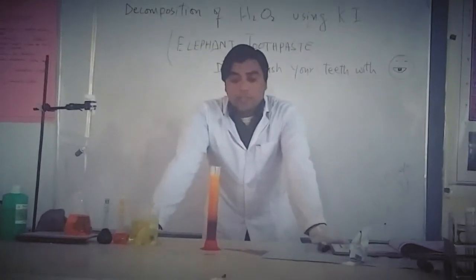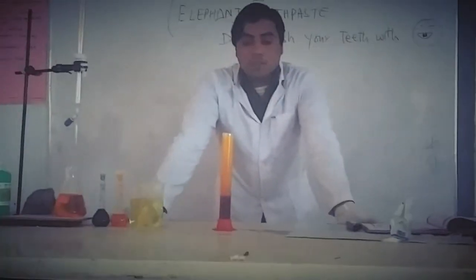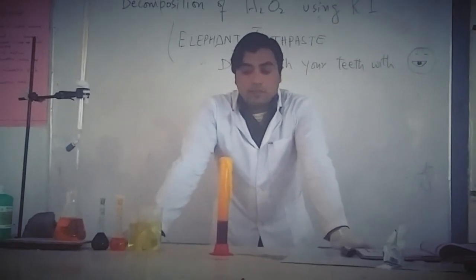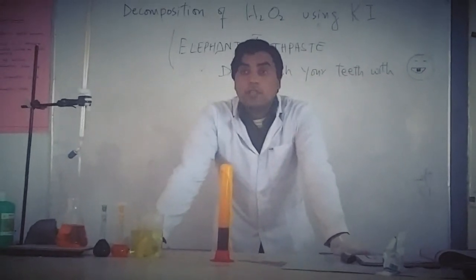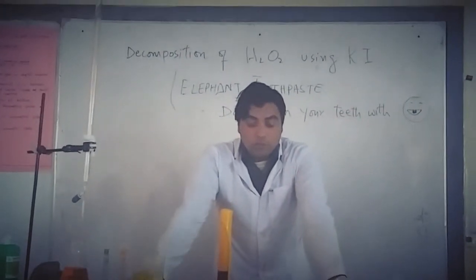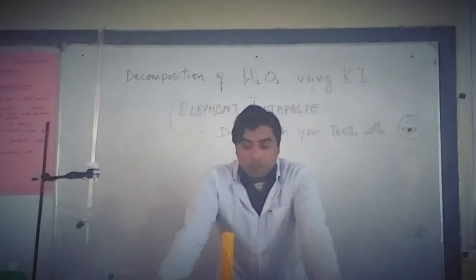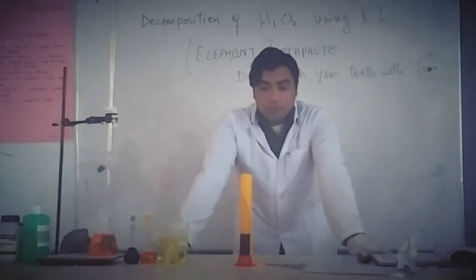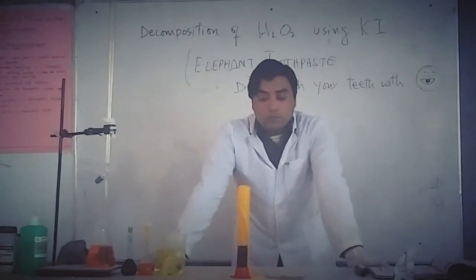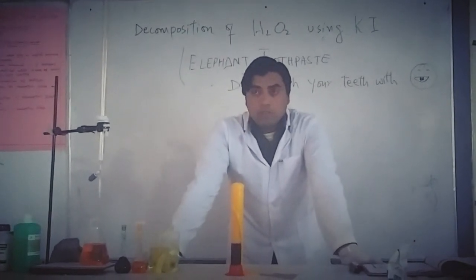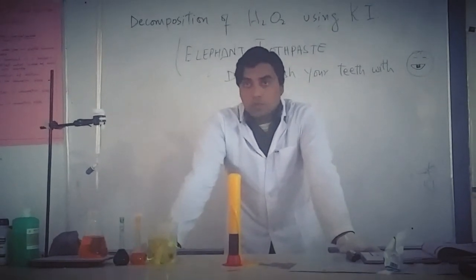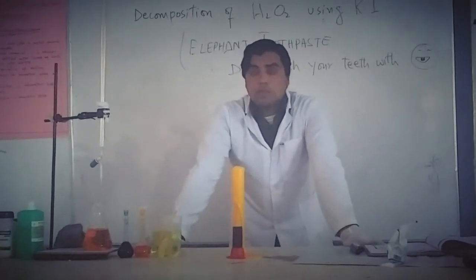So let the reaction start. Keep in mind, this is a highly exothermic reaction. The rate of decomposition of hydrogen peroxide also depends on the purity of the catalyst.